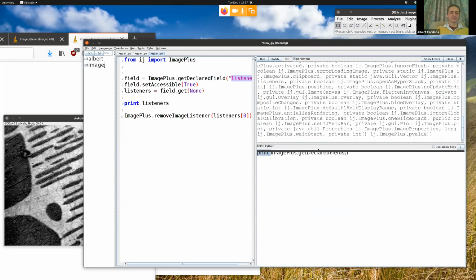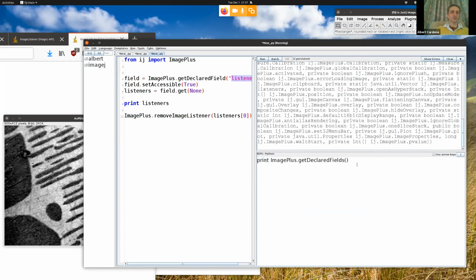Yes, what the persistent does is two important things. One, it gives you a prompt. But the second one that it also does, and we'll go back and demonstrate the first example, is that it keeps around everything that you've executed in the script, which is very convenient. But now let me finish what I was doing.